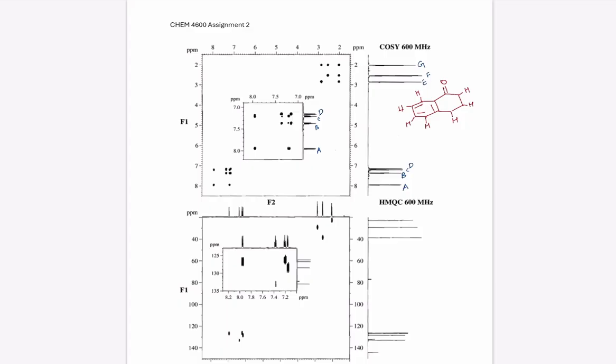And the next thing that I'm going to do is draw the diagonal. So it's better to use the ruler. Okay. So once I do the diagonal, I wanted to mark down the points, mark down the ppm values for the peaks even on the x-axis. So let's do that by drawing the perpendicular lines here.